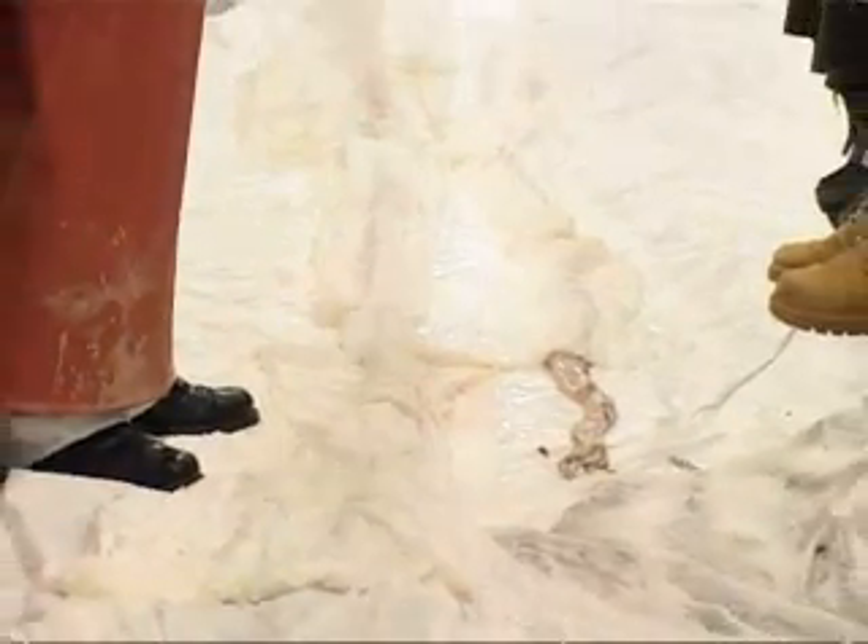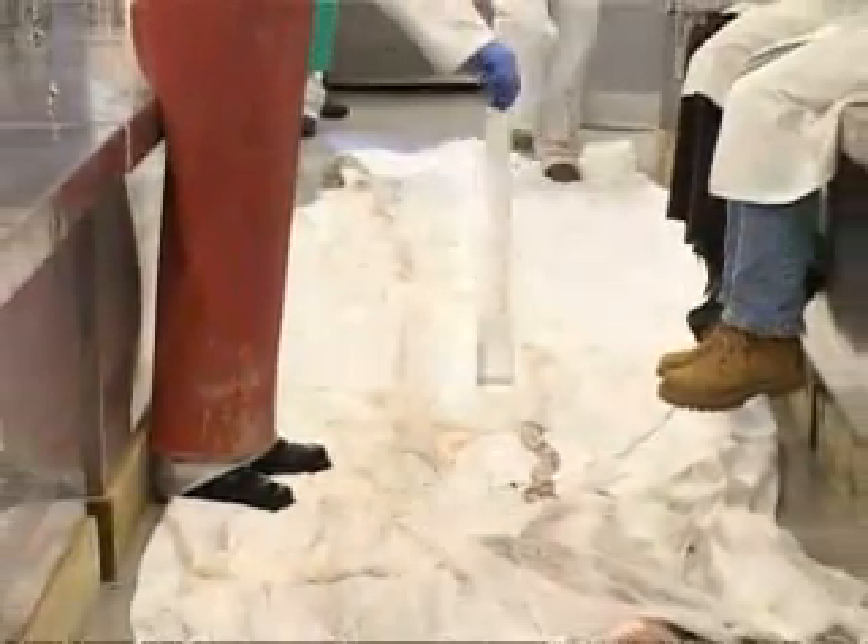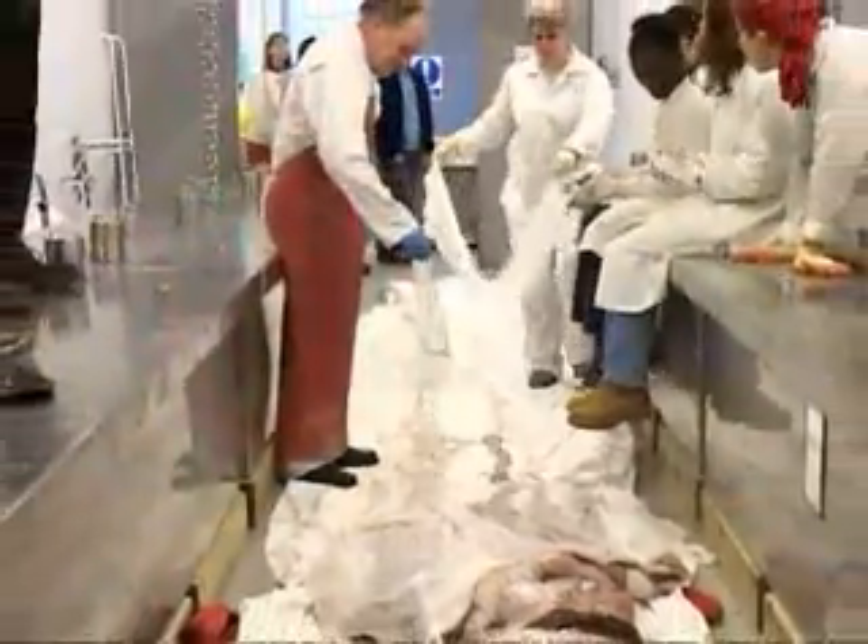At this stage we're just keeping the giant squid moist as we're preparing the fixation. This stops the specimen from drying out, which would damage it before we preserve it.